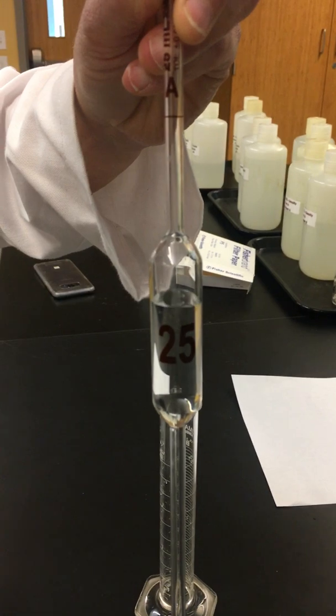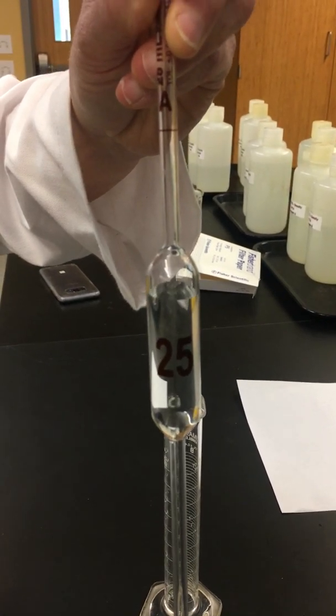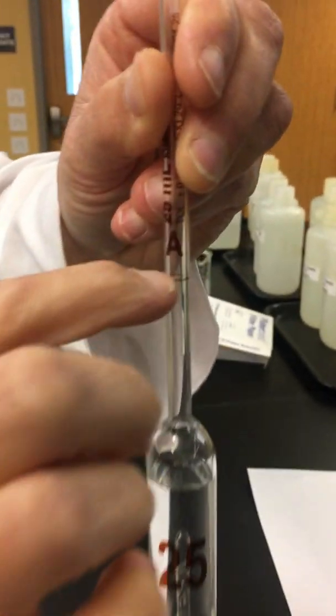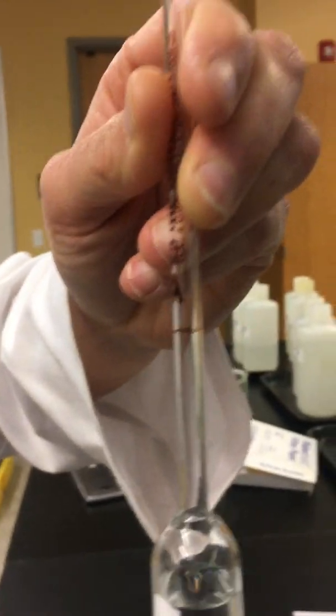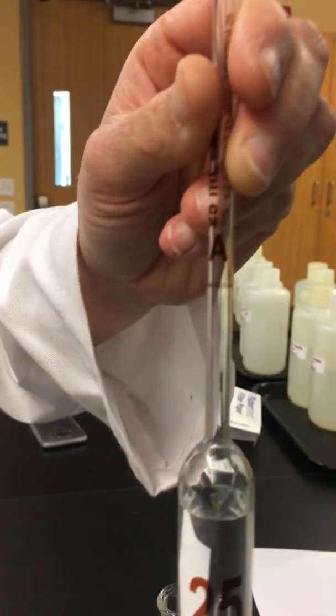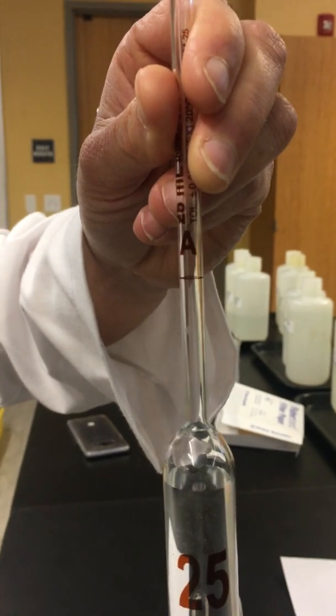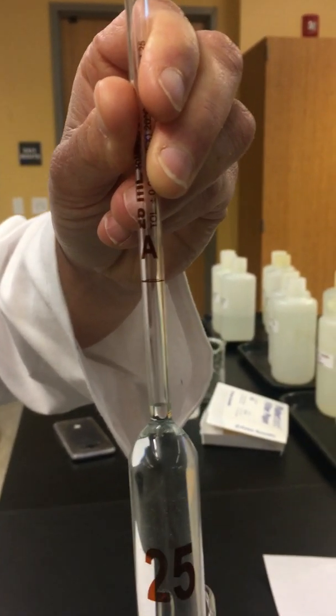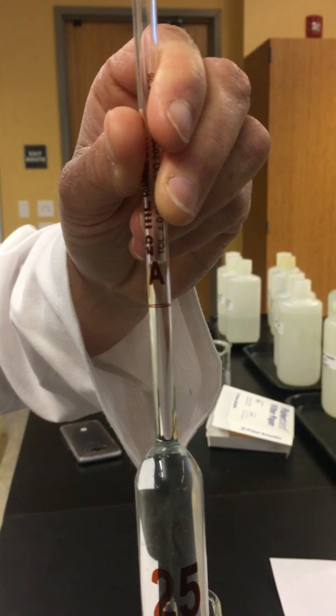Now every single one of these volumetric pipettes has a line on it, and this line is calibrated to be 25.00 milliliters. We want to pull up our liquid, and we always pull it up a little bit above.